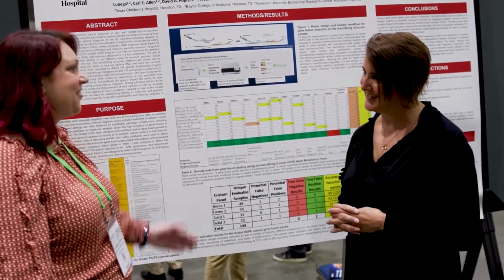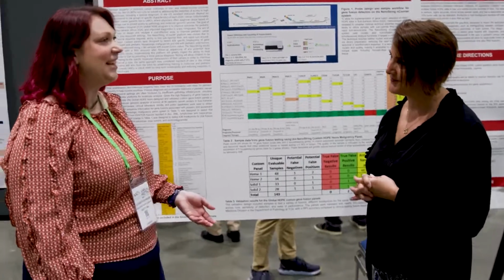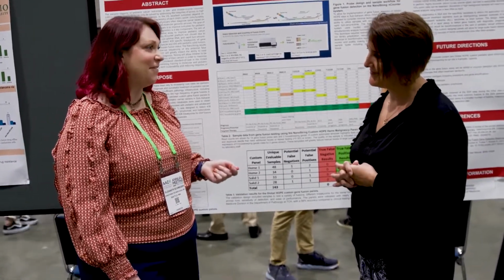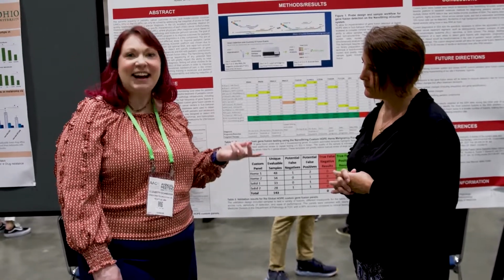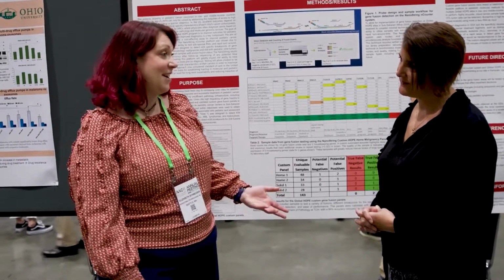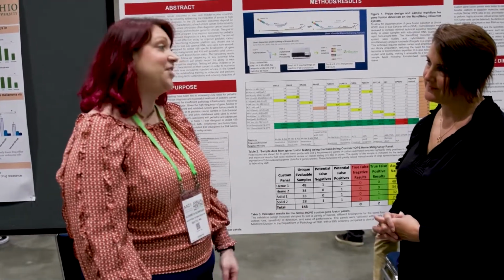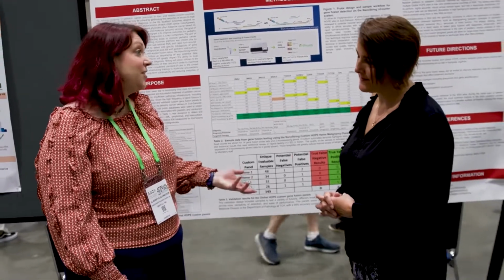Oh, that's really, really great to hear. So actually, that would be, I think, the third nCounter instrument in the continent of Africa. Recently, we just had the second nCounter system, which was shipped to the Gambia with the London School of Hygiene and Tropical Medicine, and there they're actually using the nCounter to study tuberculosis.